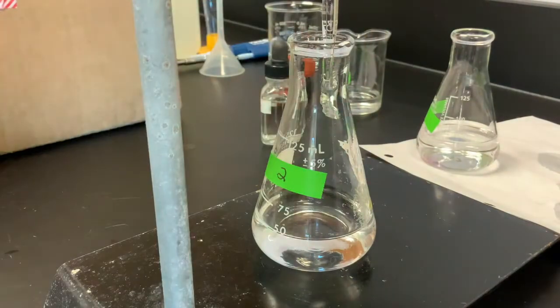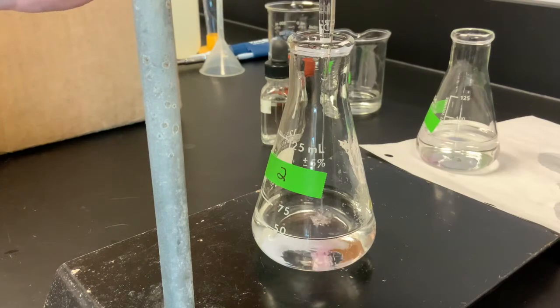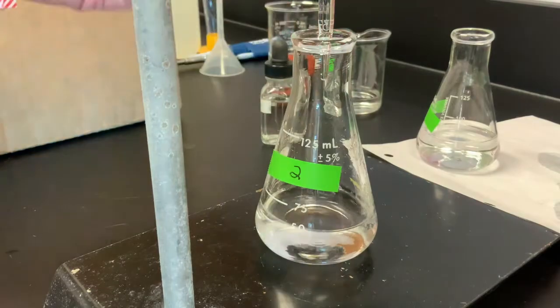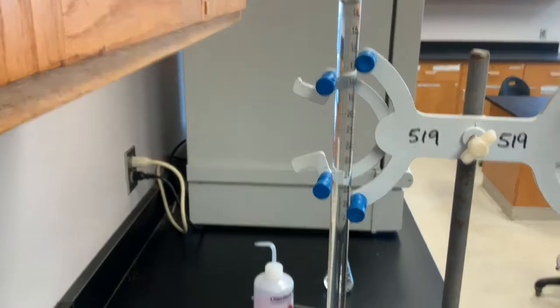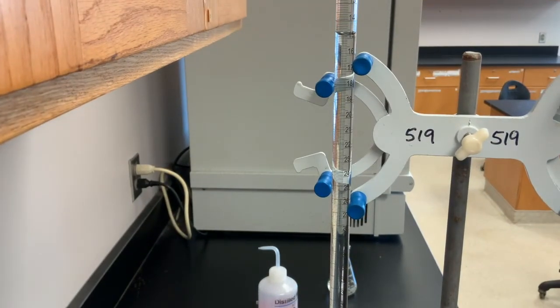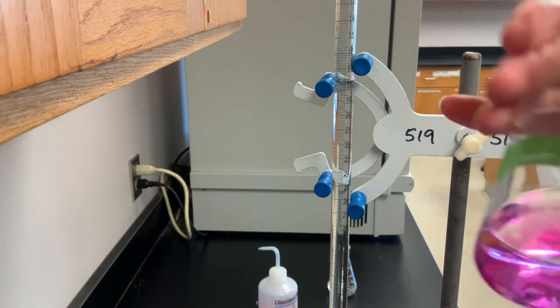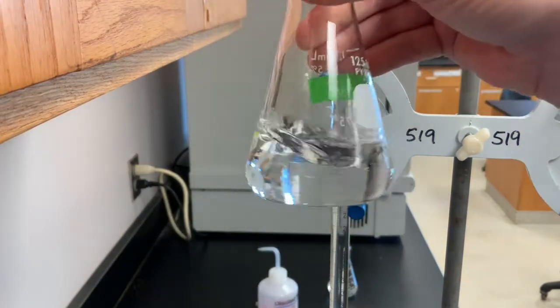So I'm adding rapidly, and we are seeing some pink show up, but remember our endpoint's not going to be until we get close to that 18 milliliters. So I'm getting a lot of pink, but it's going to go away. Again, adding it rapidly. I'm getting close to the 18. I'm going to go ahead and stop. Now it looks pretty pink right now, but goes away.